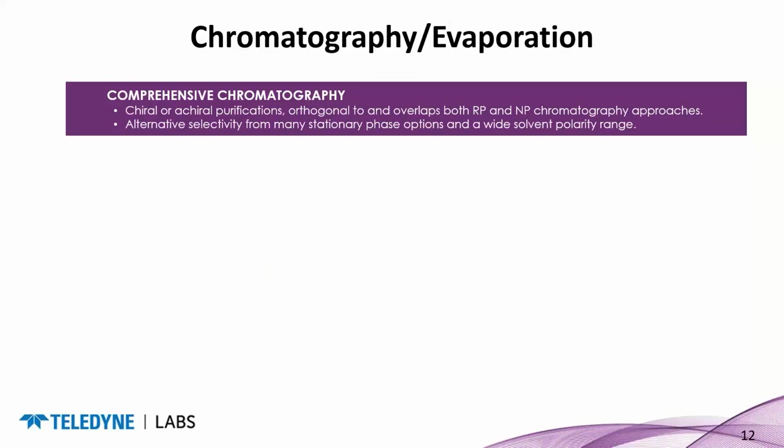So, more commentary about chromatography and why we use SFC. You can use it for chiral applications. It's orthogonal to both reverse phase and normal phase. In fact, it bridges both very nicely and could actually be used instead of both techniques for most small molecules out there, and for even some of the larger molecules, it's being looked at further.